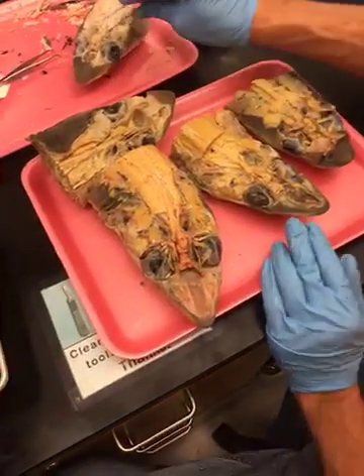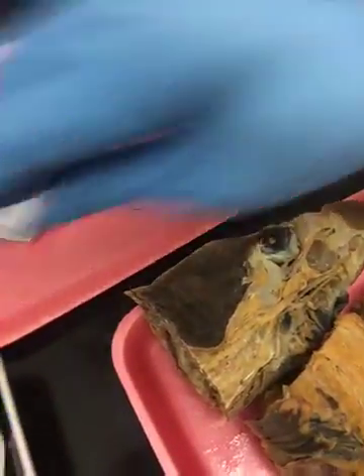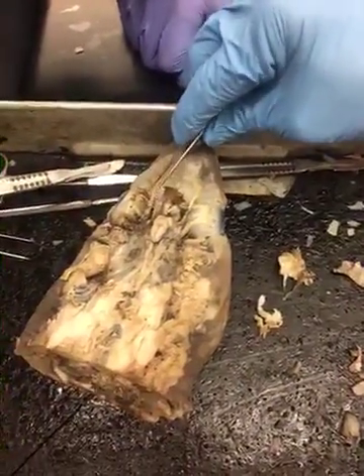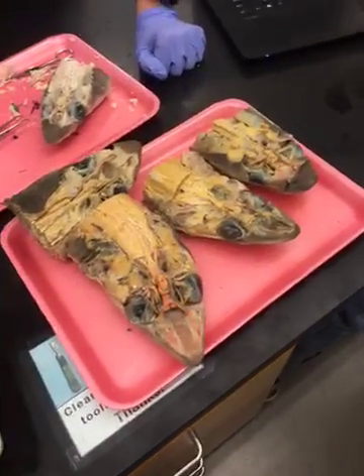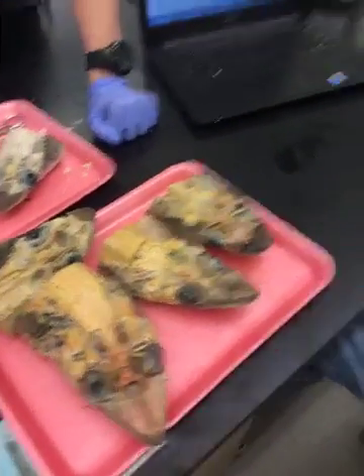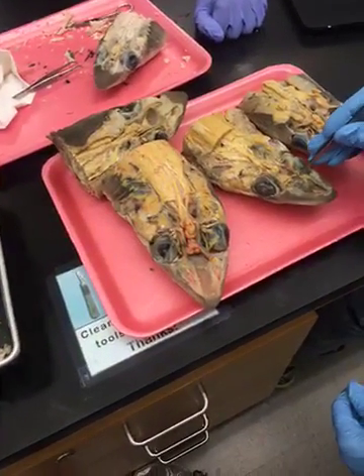This, for example, is the superficial ophthalmic nerve on your shark, and here it is on your shark, here and there. That superficial ophthalmic nerve is composed of the superficial ophthalmic branch of 5 and the superficial ophthalmic branch of 7. All right? So if I was to pin this, I could say, name the nerve.